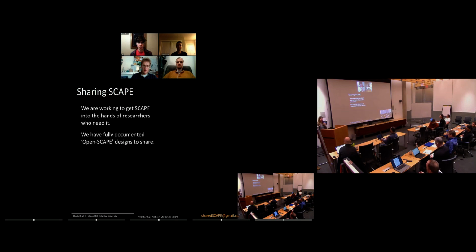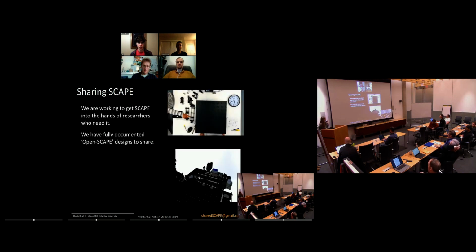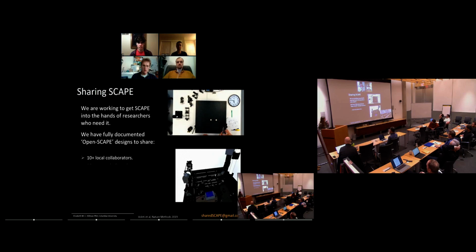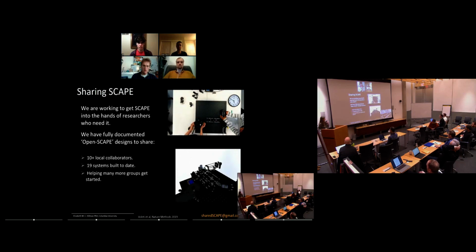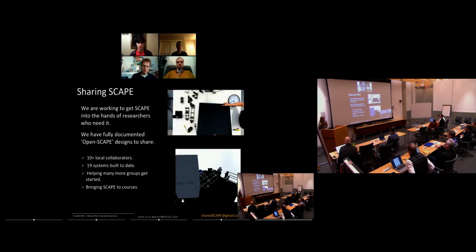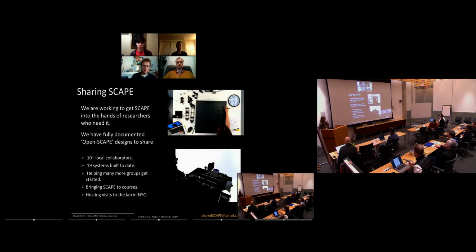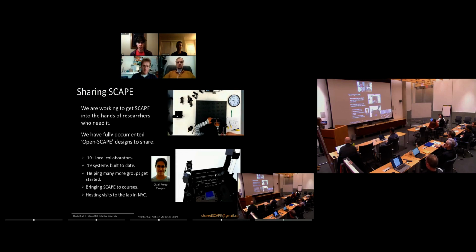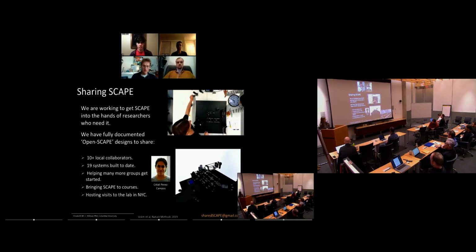Our goal is to be able to get someone who just wants to use this system to be able to get it set up in their lab and start using it. So we fully documented how to build SCAPE. We have a whole bunch of designs. We've got a bunch of local collaborators. We've built 19 systems to date. We're helping a lot more groups currently get started. We've been bringing SCAPE to courses, and hosting people in our lab. And Lali in my lab has been really the driving force behind all of this. She's basically our project manager.